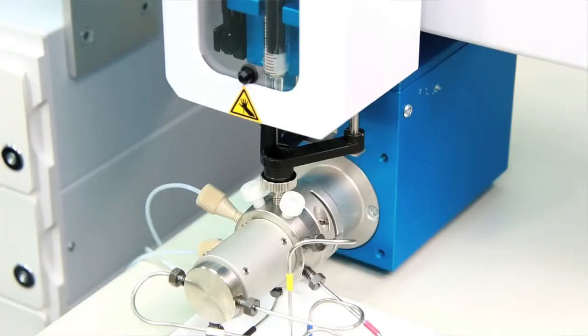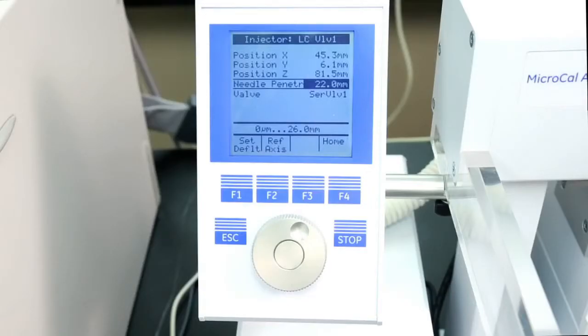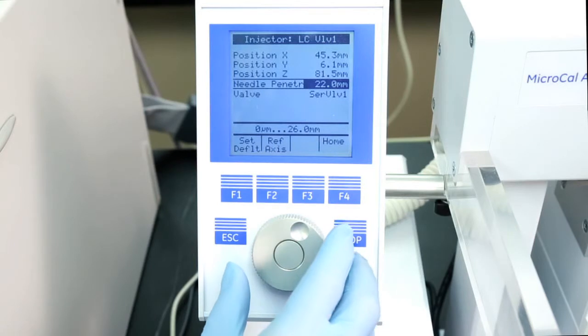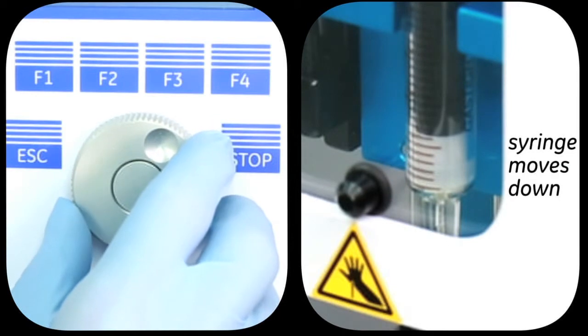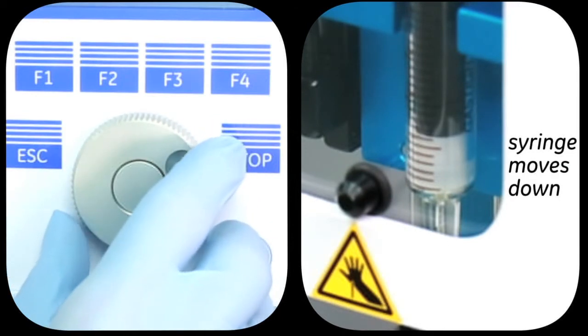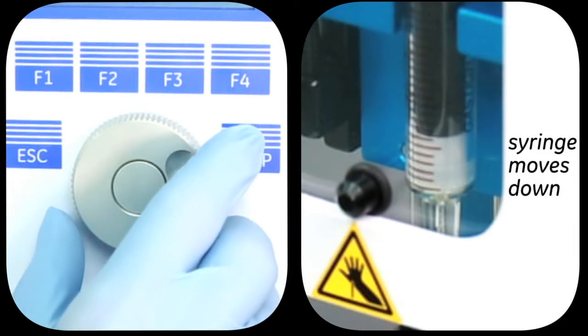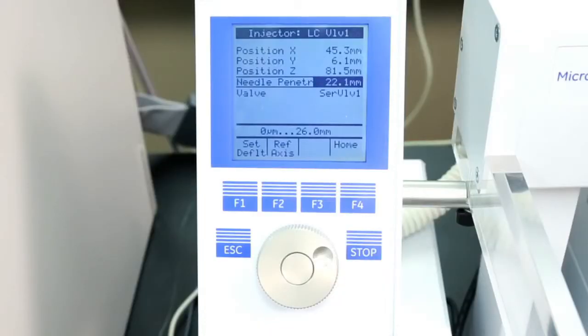Slowly rotate the outer knob to adjust the needle penetration depth. Watch carefully to make sure the needle does not bend, and listen for a click or thunk sound. You may have to rotate it once or twice. The syringe moves down stepwise into the injection port. When you hear a click or thunk sound inside the injection unit, or the needle starts to bend, you know you hit the bottom.